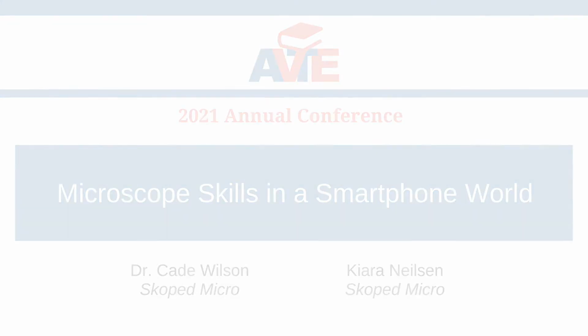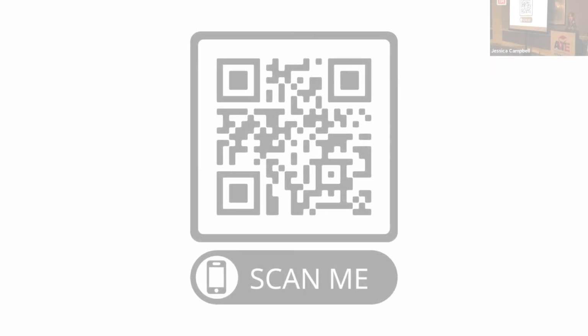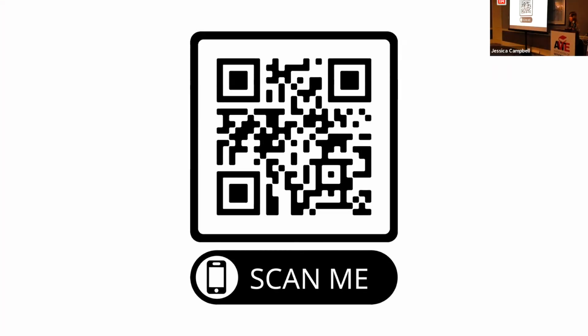So, just quickly before we really get rolling, we're going to do a live app demo. This is the first time we've ever tried this, so bear with us. If you're interested, it's a two-step process. The first thing we'll need to do is have you download the app itself. It's the Skoped Micro app.